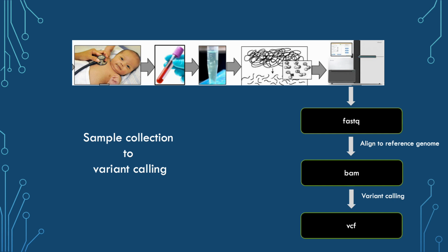There are multiple steps from sample collection all the way to data processed into VCF format for genome and exome sequencing, so things could go wrong at multiple steps. For example, the sample in and of itself could have been of bad quality, or there may have been a sample swap, or a sample contamination.